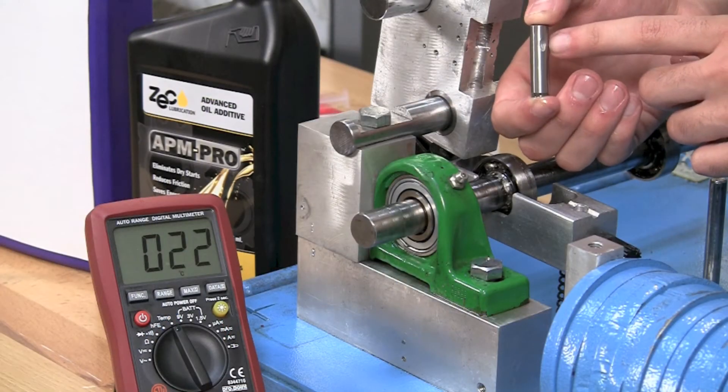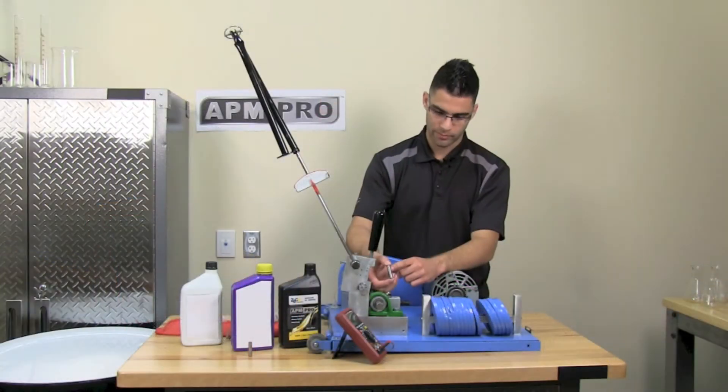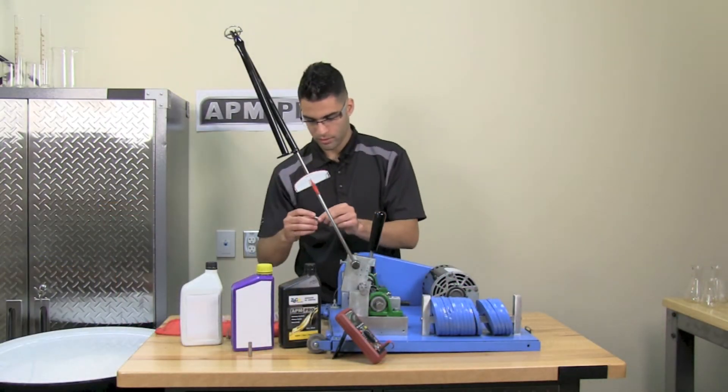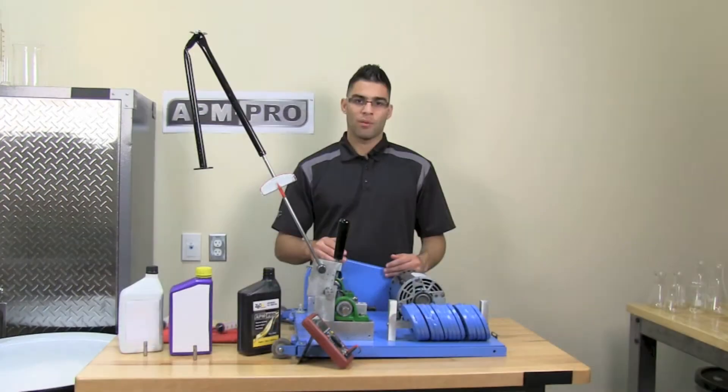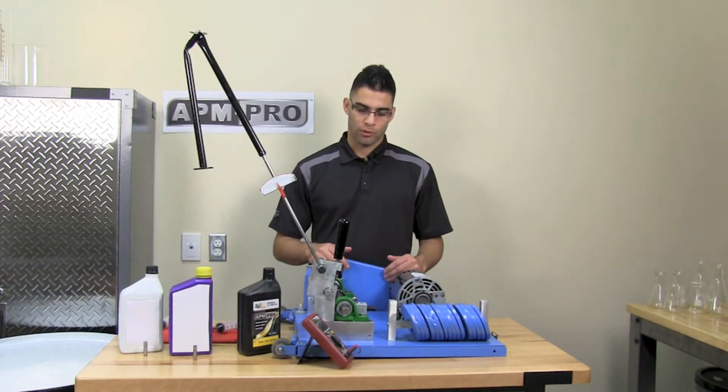It also took five weights. As you can see, the scar is slightly bigger than the synthetic oil. We have once again cleaned the bearing for a fresh start.